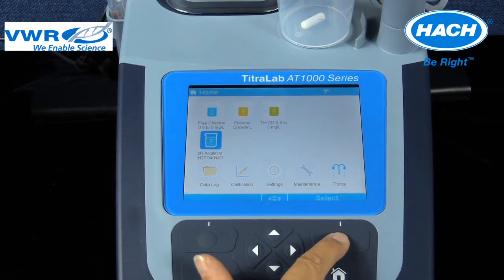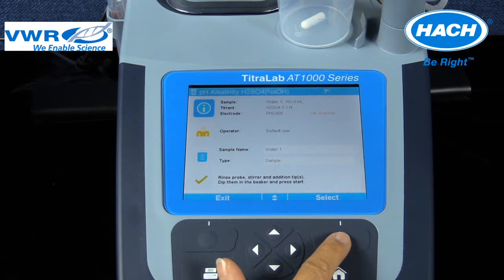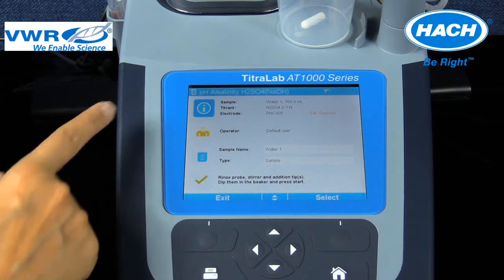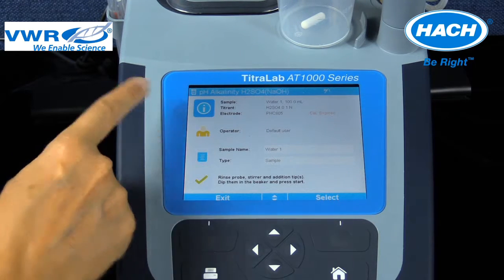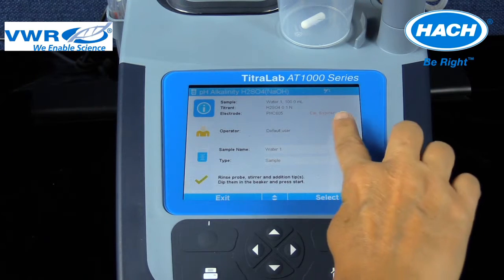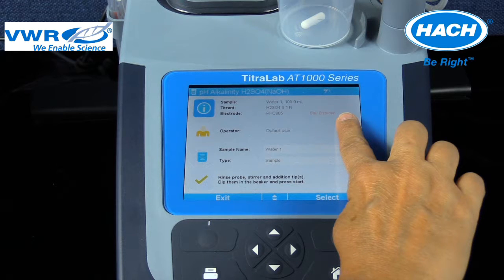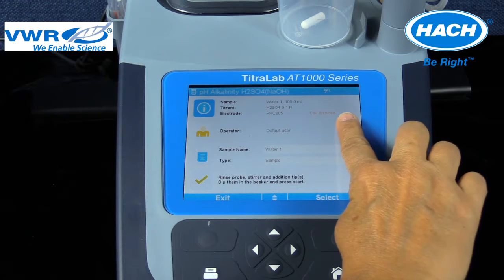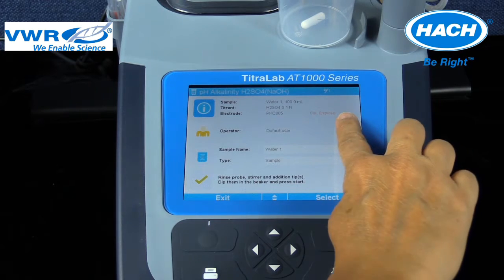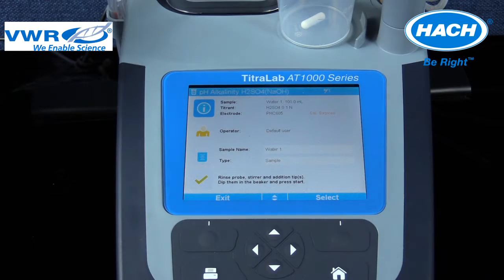In this training example, the AT1222 model is used in the loaded pH alkalinity H2SO4 method screen, and has alerted the user in red text that the PHC805 electrode is using an expired calibration. The software is utilizing a pre-programmed calibration setting to generate this message.